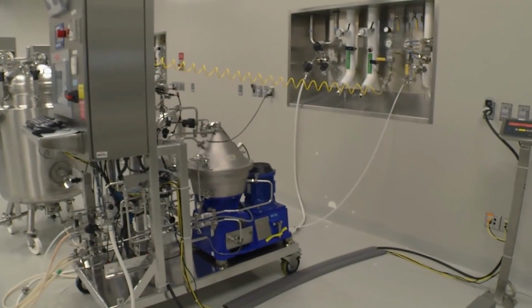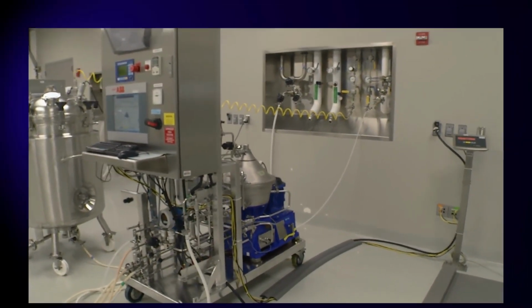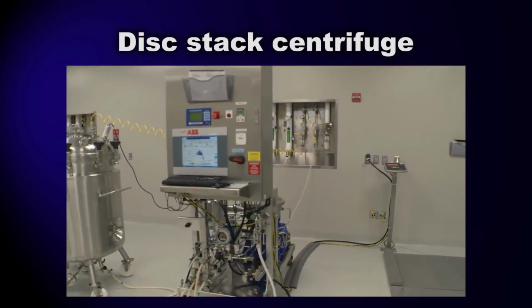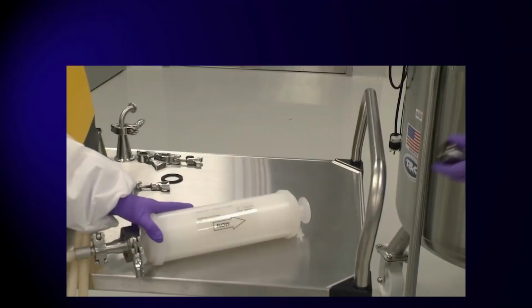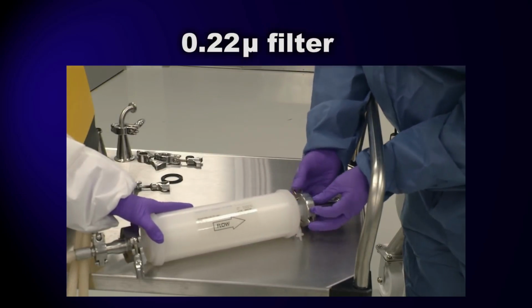Let's start with the tools we'll use in the green fluorescent protein recovery process. Those would include a disc stack centrifuge to separate solids from liquids, a homogenizer to break open the E. coli cells, and a 0.22 micron filter to separate any remaining solids in the product solution.